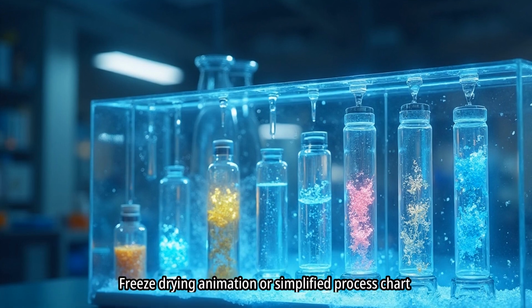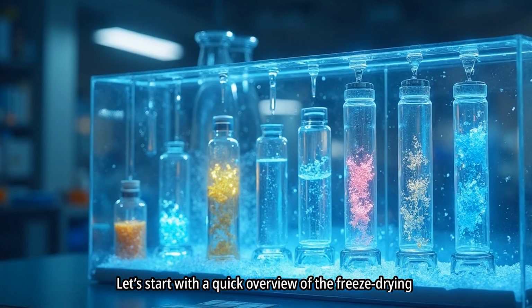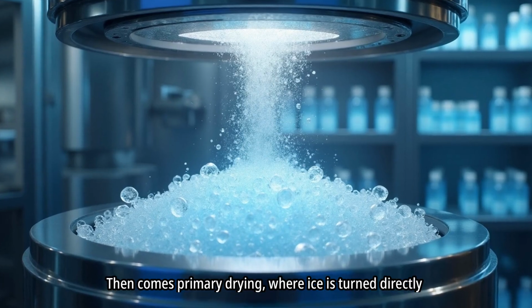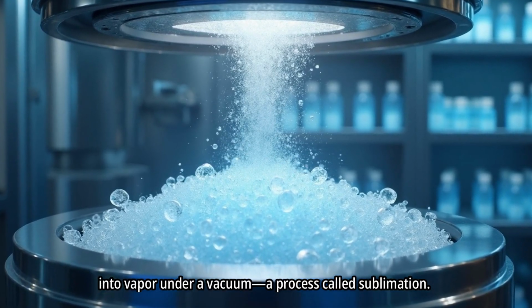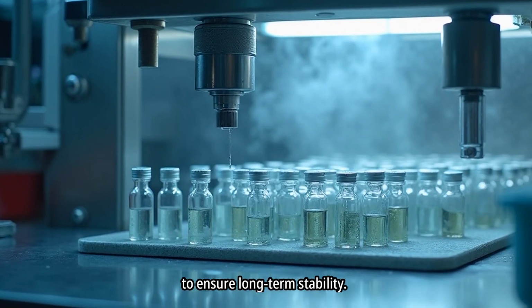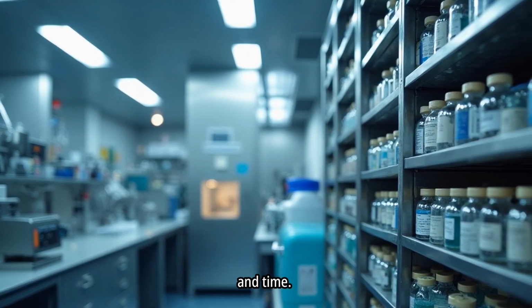Let's start with a quick overview of the freeze drying process. It begins with the freezing stage, where your product is frozen solid. Then comes primary drying, where ice is turned directly into vapor under a vacuum, a process called sublimation. Finally, secondary drying removes any leftover moisture to ensure long-term stability. Every stage requires precise control of pressure, temperature, and time.